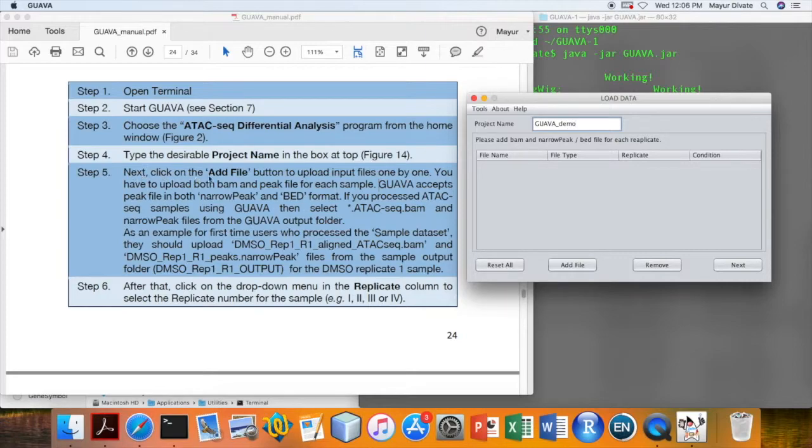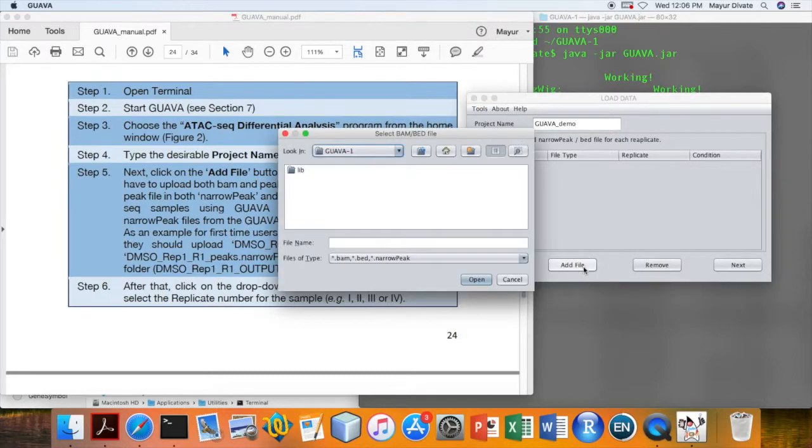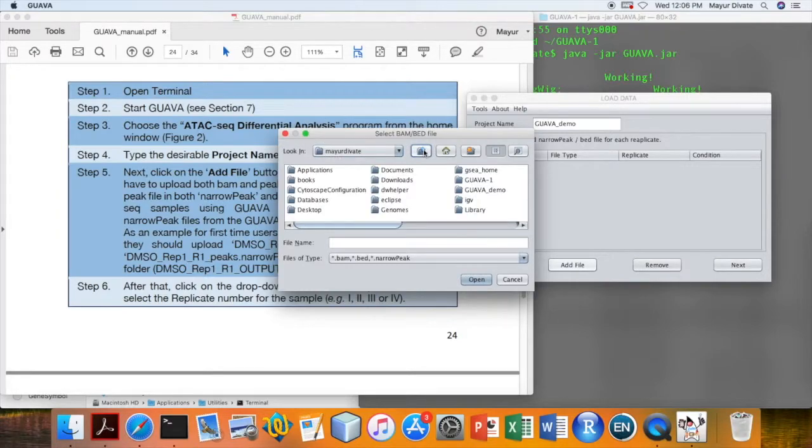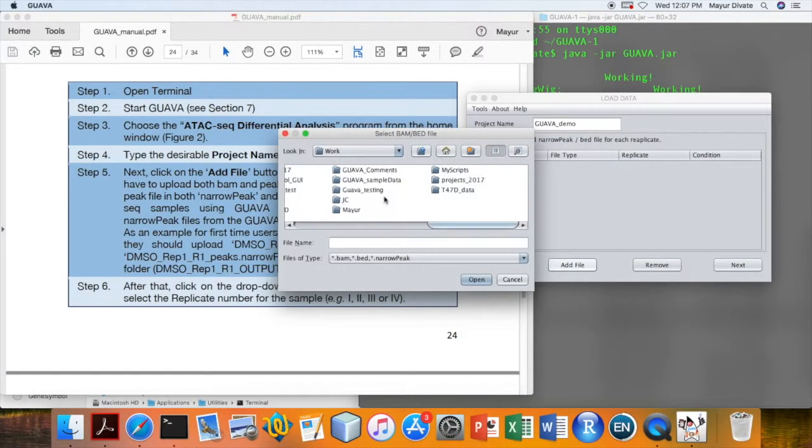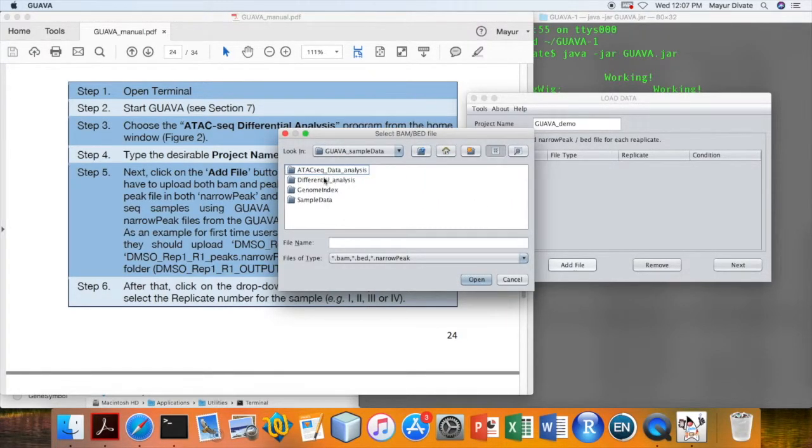Next we need to load BAM and peak file for each sample. Click on the add button. This will open a file browser and then you can browse the files from the previous analysis.